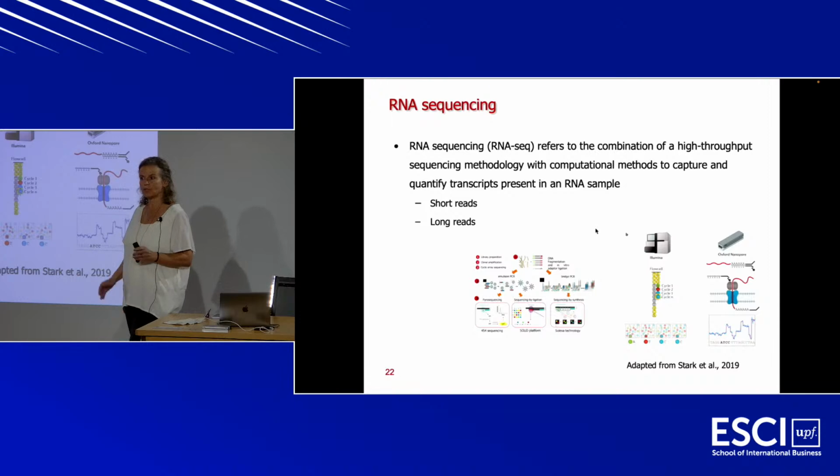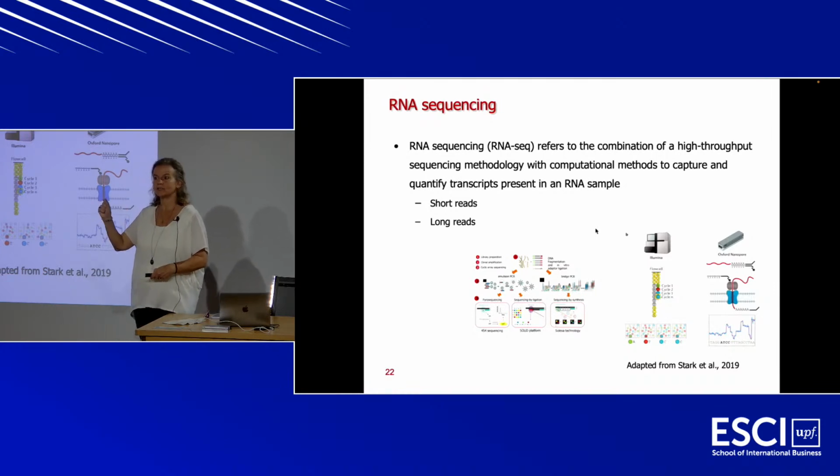But basically what we do is we amplify the sample. Well, in general there are many technologies here, but we fragment and amplify the sample, and we obtain different fragments. And those fragments undergo a flow cell process in the Illumina technology that will tell us whether this is an A, a T, a C, or a G. And this is what you know that belongs to the DNA. So once we know the different sequences, we can infer these into the genome.